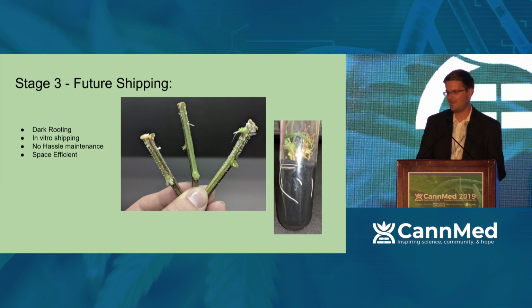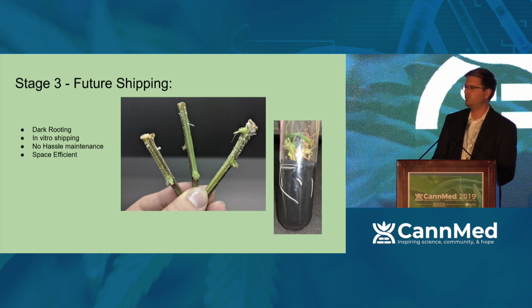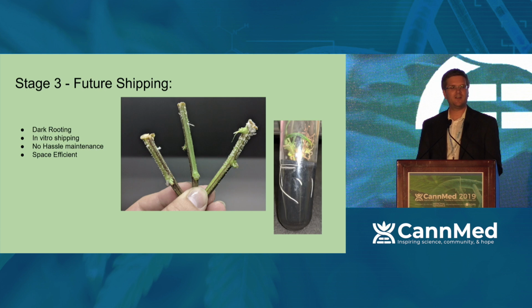So one of the keys I want to stress here is stage three has the potential to ship plants in the dark. I did a small scale trial on this where I did no more than 24 plants and I rooted them in the dark. That first picture is how I got the idea. I had cut a plant down, this is cannabis, and I had stuck it in a 55-gallon trash bag and forgotten about it for a little over a week.